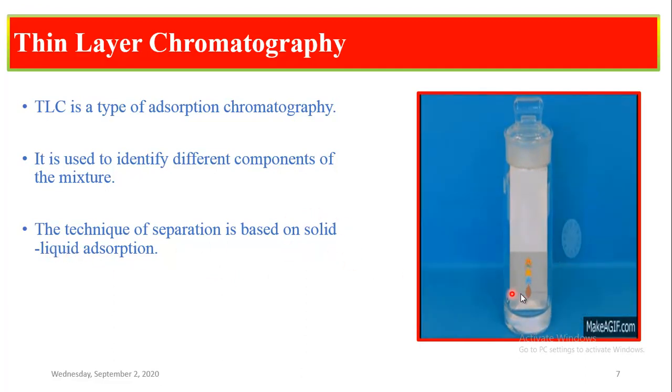Here in this diagram, as you see, this is the stationary phase, which is solid, and this is the mobile phase, which is liquid, which separates the components of the analyte into different individual components. So this is the phenomenon of separation of a mixture.